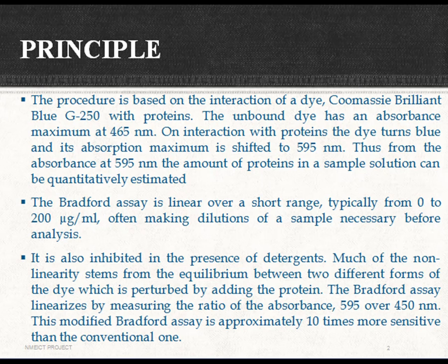The unbound dye has an absorbance maximum of 465 nanometer. On interaction with protein, the dye turns blue and its absorption maximum is shifted to 595 nanometer. Thus, from the absorbance at 595 nanometer, the amount of protein in a sample solution can be quantitatively estimated.